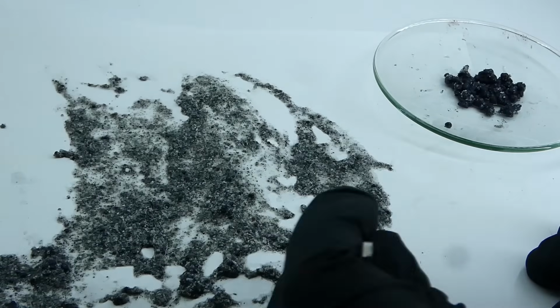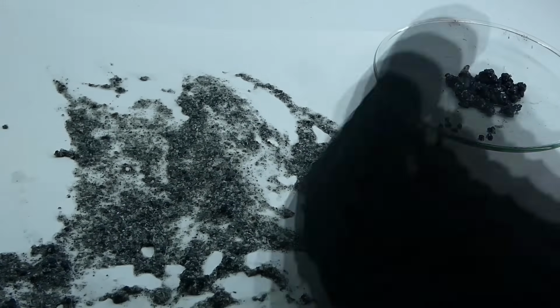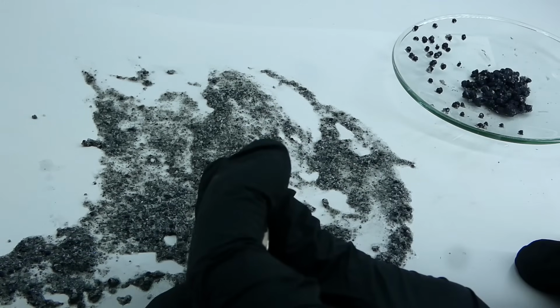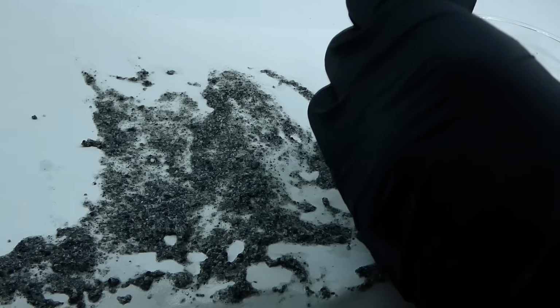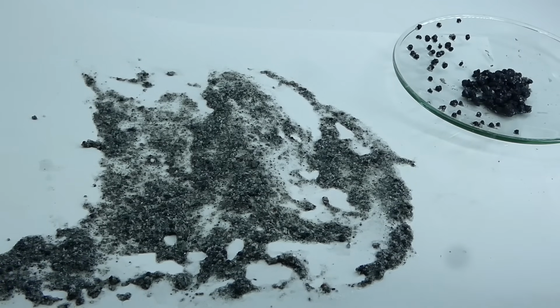I ended up using a pair of tweezers, and after about 40 minutes of painstakingly picking up these little beads, I was left with a pretty decent amount of them. I mean, this isn't even close to being a good yield, but I don't want to make my whole neighborhood smell like rotten eggs again, so I just have to use what I got.